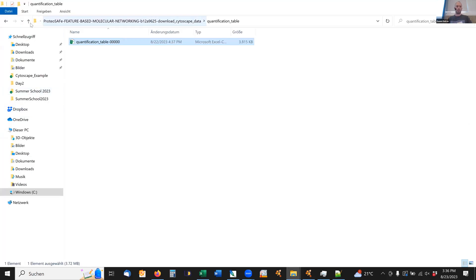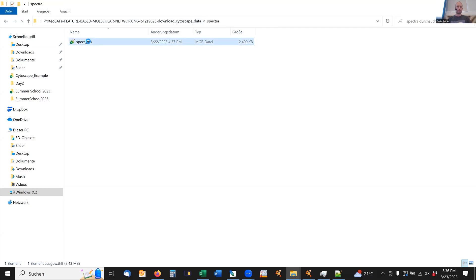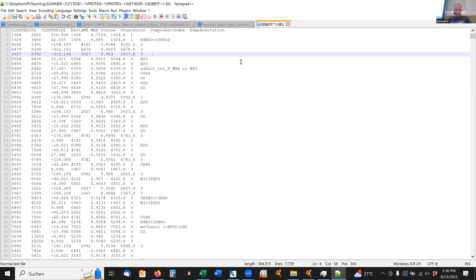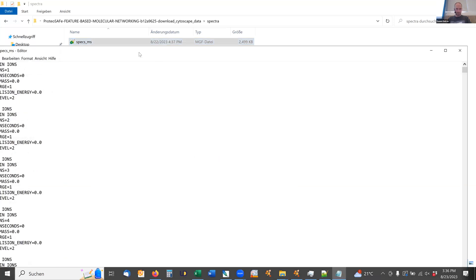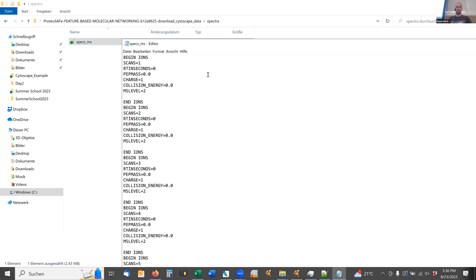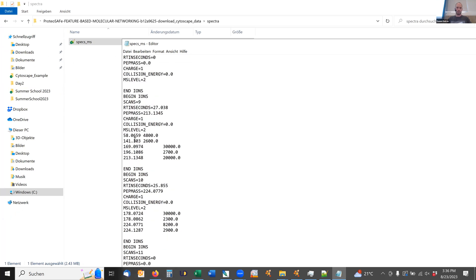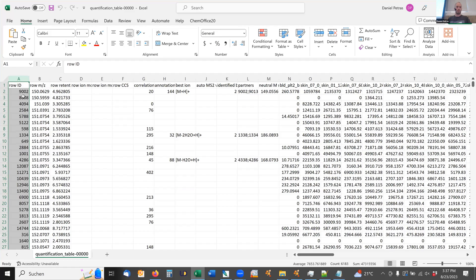If you open the MGF file — which should also be output from GNPS and which you also got from mzmine yesterday — and open it in Notepad, you should see that there is a scan number in the header. There are some with fragment ion information, and those are the different masses with intensities. The scan number in the header is the same number as the feature number in the feature table, and that is the connecting thing — also in the network, that is the connecting information.